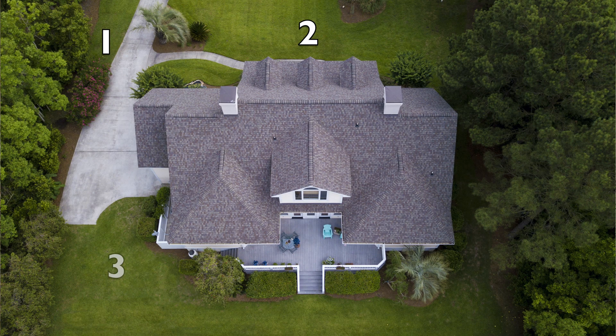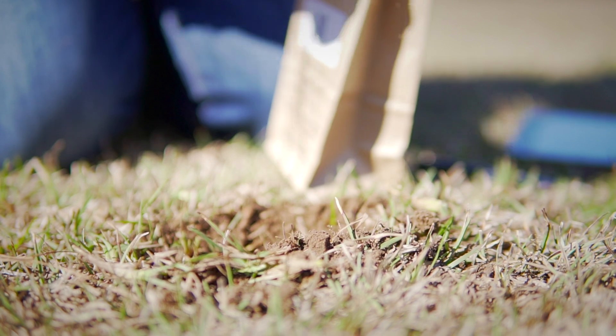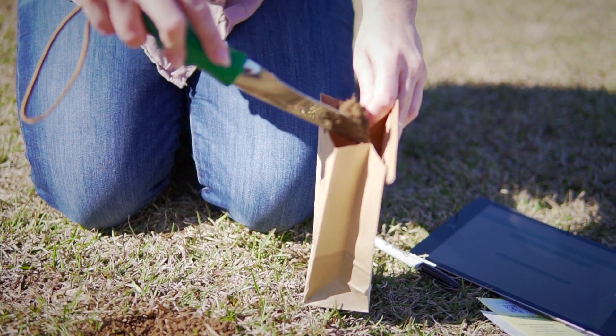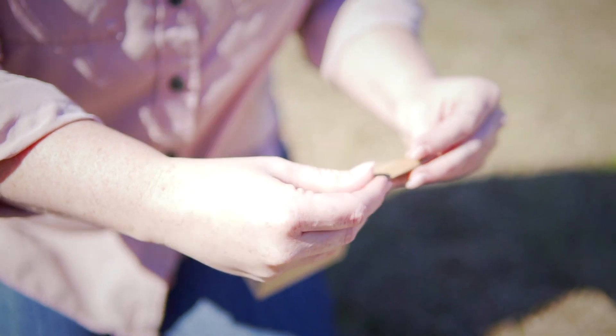In choosing four sample locations, try to evenly distribute them across the sample area and avoid wet spots. Collect two scoops of soil at each location, two to four inches from the soil surface. Ensure the dirt has reached close to but not beyond the fill line.